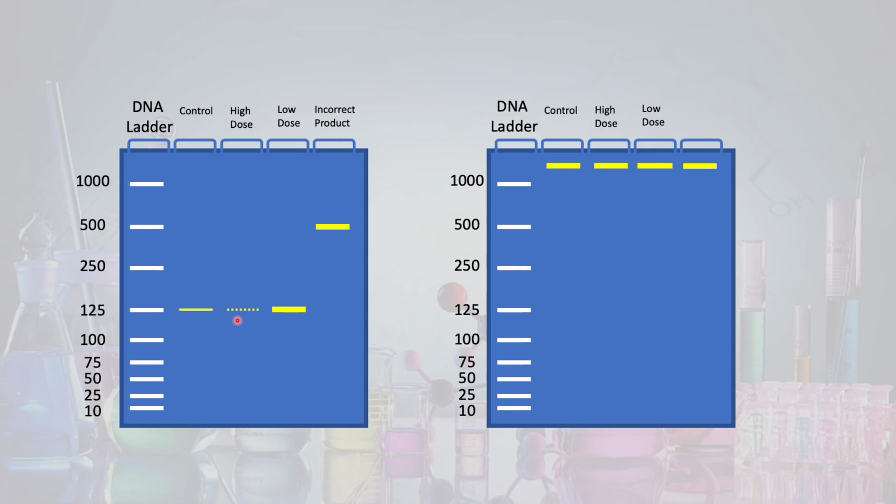So the way we can control for this, I technically gave it away earlier when I discussed that while we amplify our gene of interest in PCR, we're also amplifying a housekeeping gene, right? So technically when we run our samples, we're going to see something more like this, right? So 3 treatment groups again. So again, control, high dose, low dose, and then this guy over here that I'll explain when we get to him.